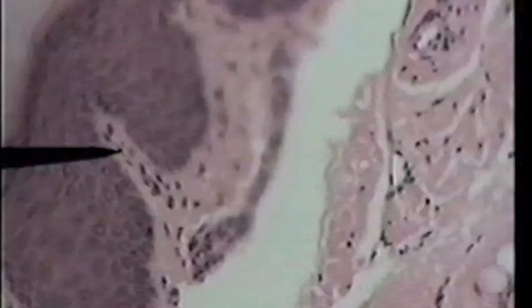It's a papillary layer because there are little papillae that extend up and anchor the epidermis to the dermis. The tip of the pointer here is in one of those little papillae. You can see another one just up on the screen from it. They extend up into the epidermis, and they are a good anchor between the epidermis and the dermis.